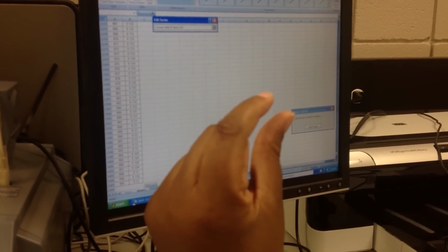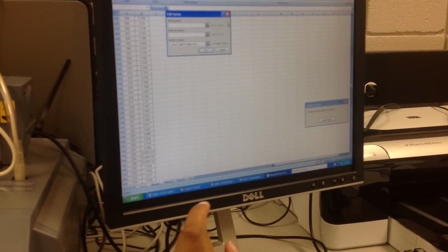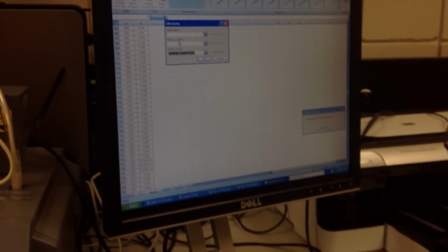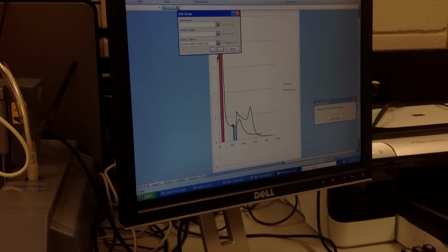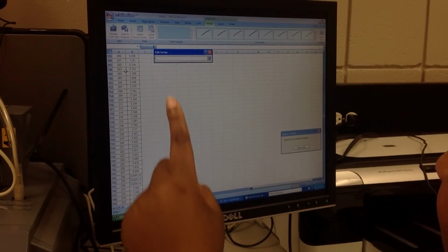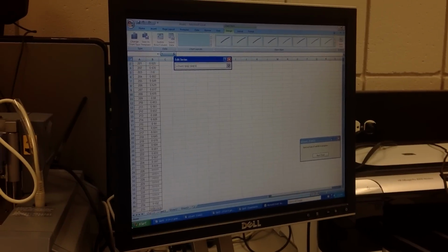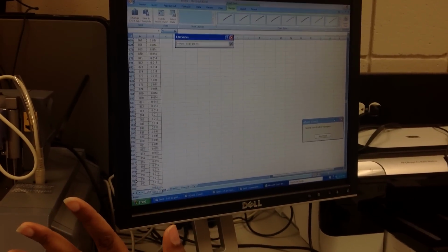Now when you're comparing them all, if they've been taken at the same wavelength interval, then you're okay, because now you can use the same ones that you used before if you want to. You can use those, or you can go back up here and use these, either one, because they're the same wavelengths that we're comparing them against.